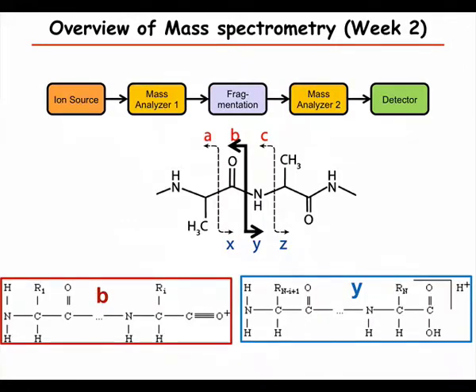And also, the simple mass spectrometer is often not used, but one can elaborate on it. For example, this shows where you have two mass analyzers and a fragmentation chamber in between. This is what most mass spec experiments involve. The idea is to use the first mass analyzer to select a specific peptide, then fragment it, and then analyze its fragments.